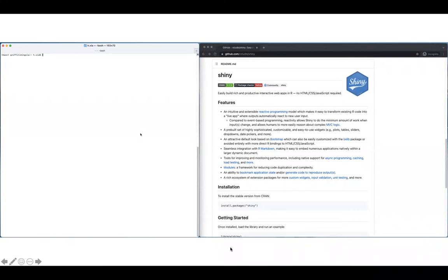This is a demo of pVACview. I will be walking through the steps of launching pVACview, either through Terminal or RStudio. Afterwards, we will walk through the steps of uploading, visualizing, exploring, and eventually exporting your results, all using a demo dataset.